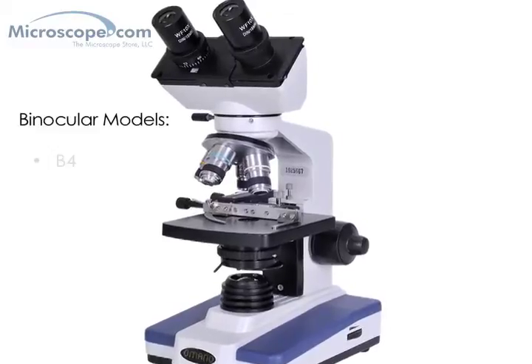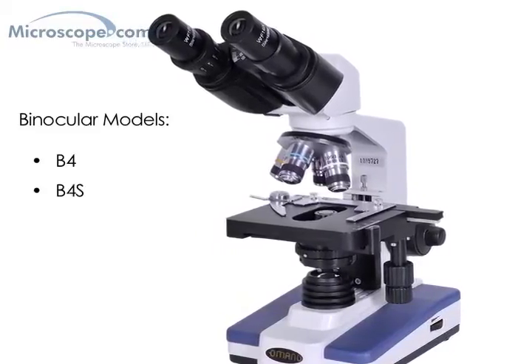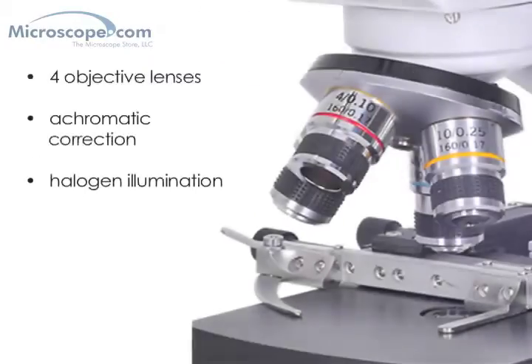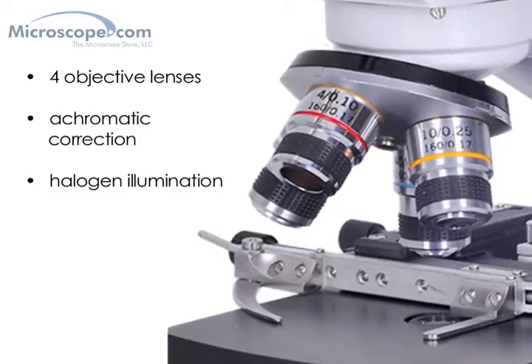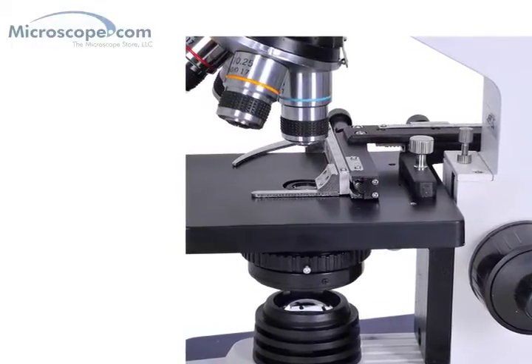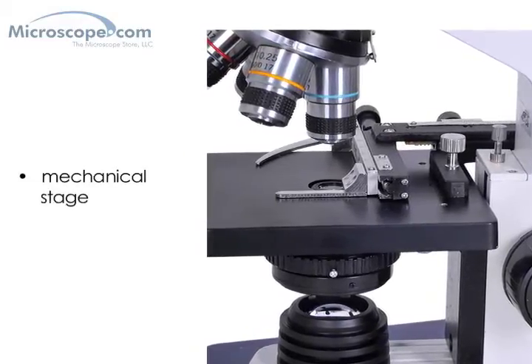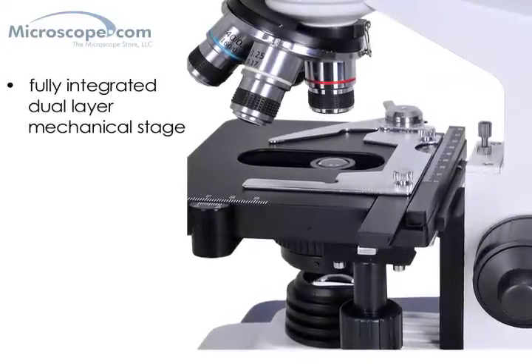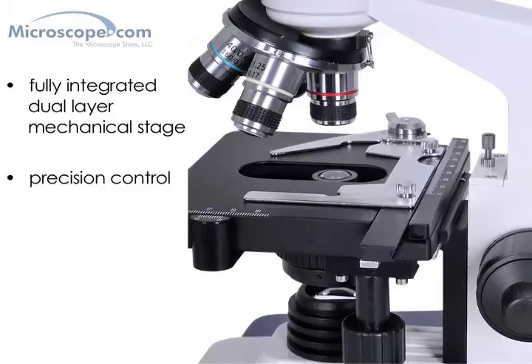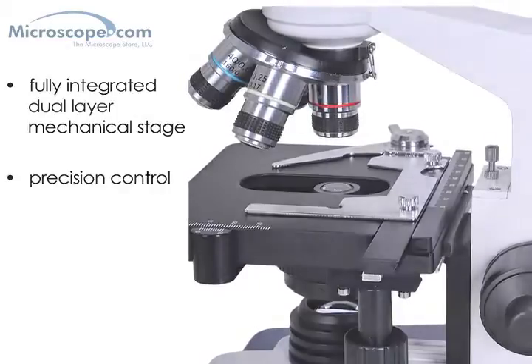There are two binocular models in the 118 range, the B4 and the B4S. Moving up to a binocular microscope gives a much clearer, more natural view of the specimen since the user is using both eyes at once, so it's definitely worthwhile if you want the best view. Both binocular models feature four objective lenses with achromatic correction and halogen illumination for a bright, clear image. The primary difference lies in the stage design: the B4 model has the same type of mechanical stage attachment seen on the M4, while the B4S model has a fully integrated dual layer mechanical stage — by far the more professional option, giving precise control over specimen motion and easy drop-down controls on the side of the stage, making it simple to move around on the slide without taking your eyes away to find the controls.